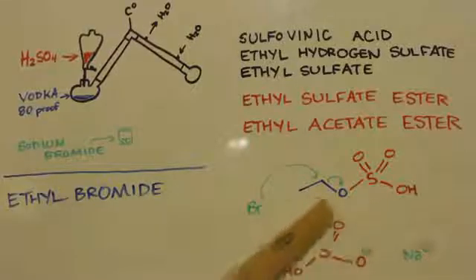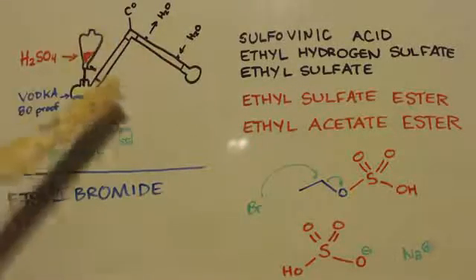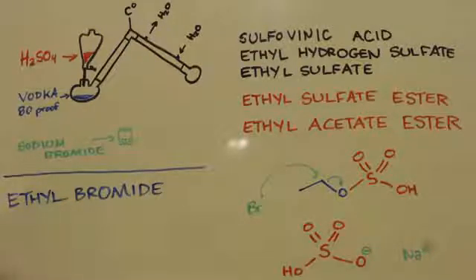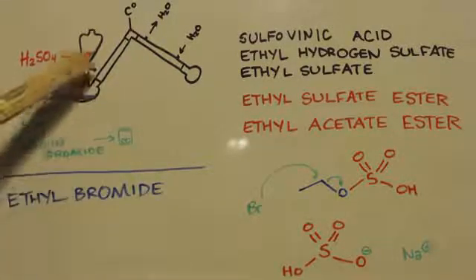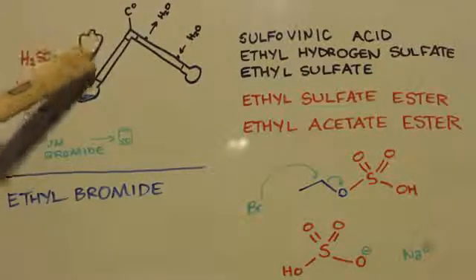Here's a picture of it. That's what you're making when you drip it in. After I drip it in, I'm going to take my sodium bromide and add it into the pot. I'm going to take this off or plug it up.